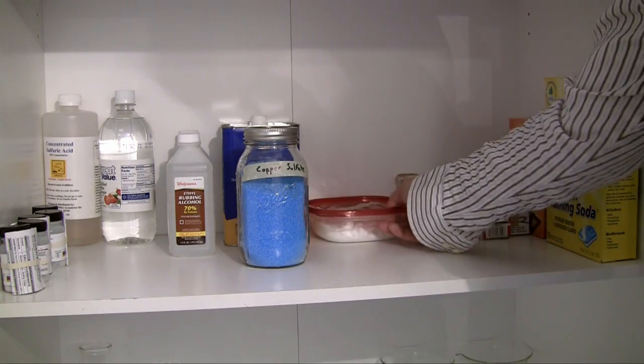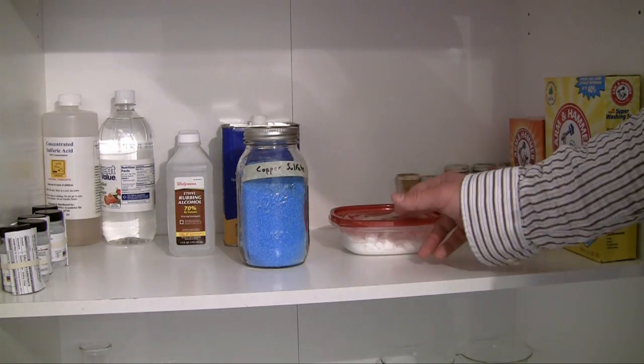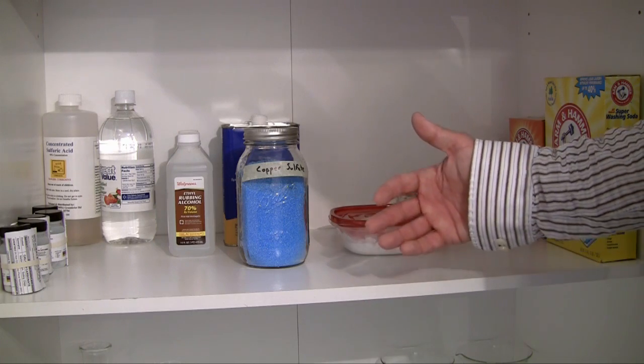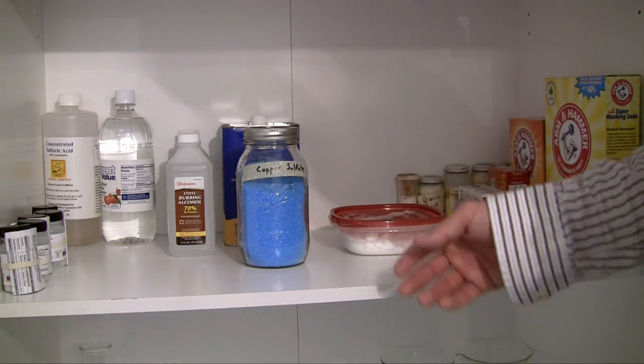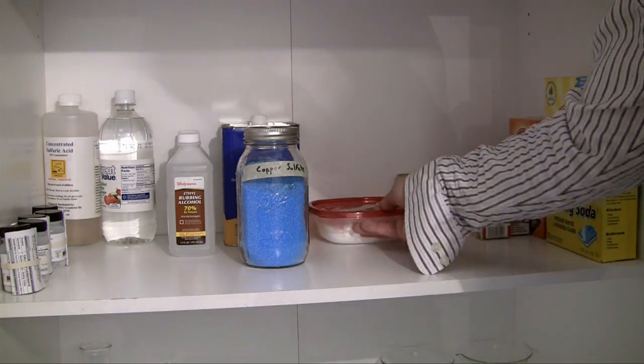For example my copper sulfate and my potassium chlorate whenever I bought them they pretty much came in like a plastic bag so obviously I moved them to a little bit better storage containers.